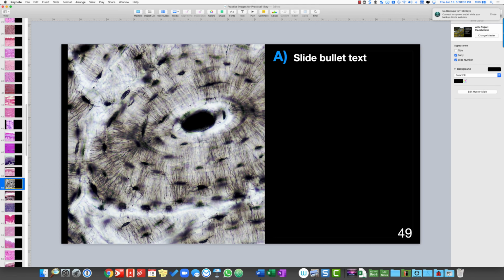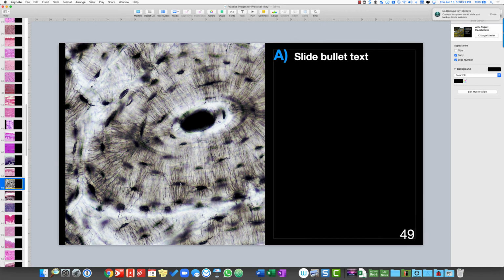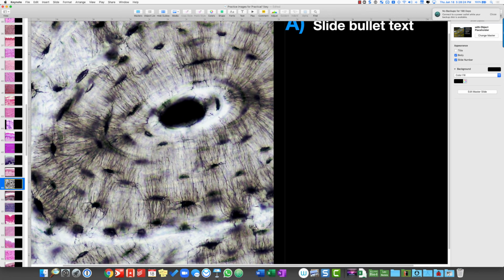Okay, so this is osseous tissue, okay, or bone tissue. Please don't say bone, because when you say bone, bone contains multiple types of tissues. Bone has vasculature, it's got nerves, it's got fat in there, it's got everything in there. Now, these are osteocytes in lacunae, okay, and they form rings.